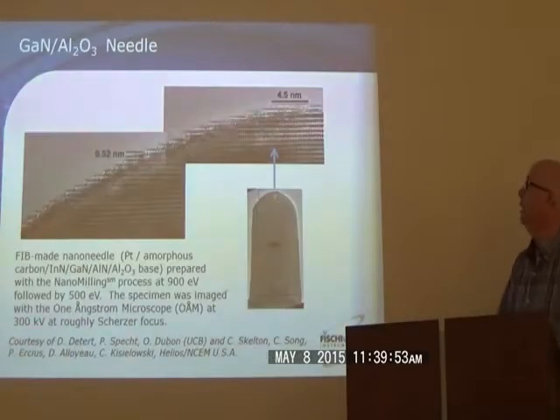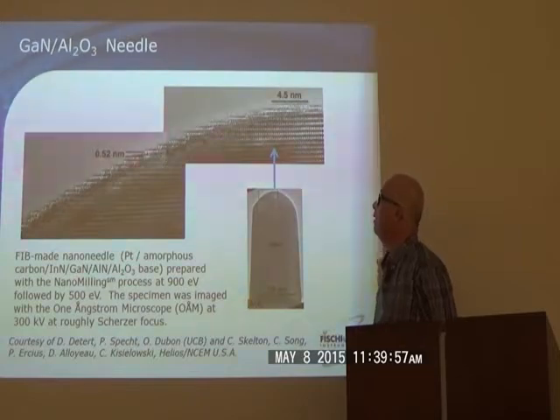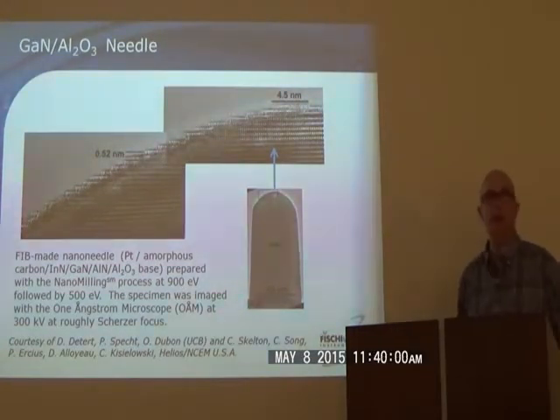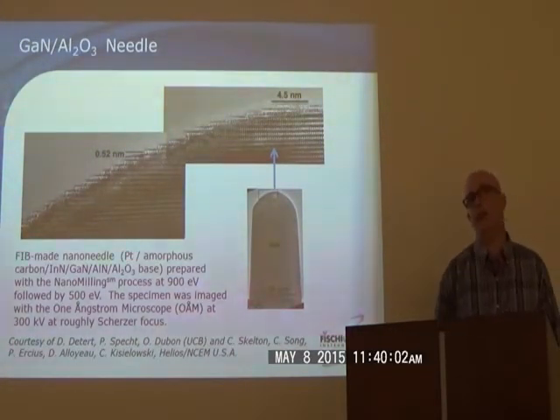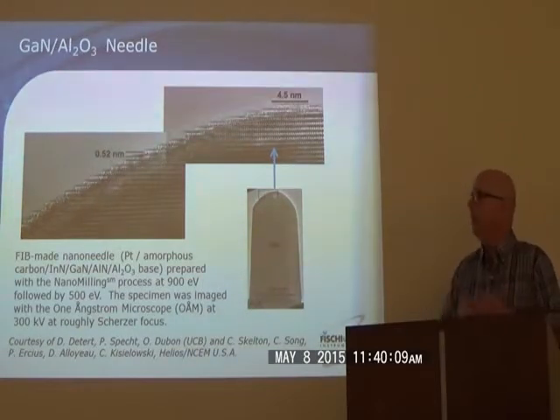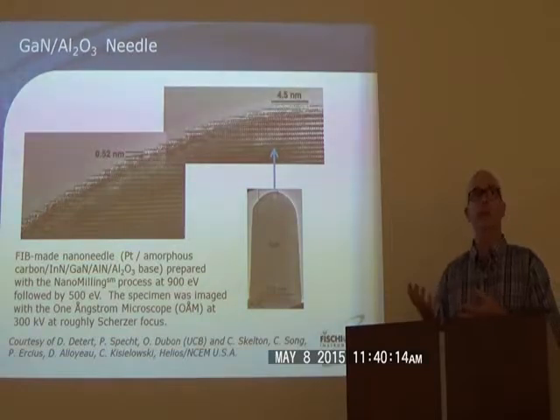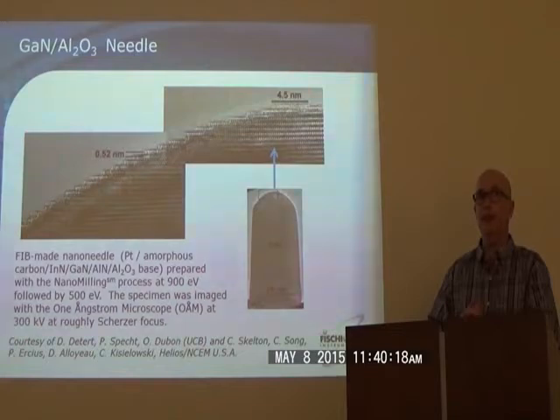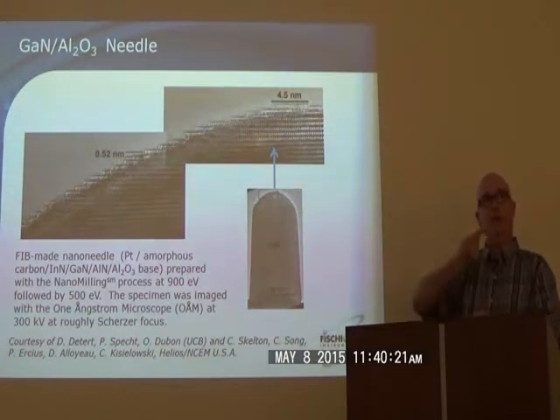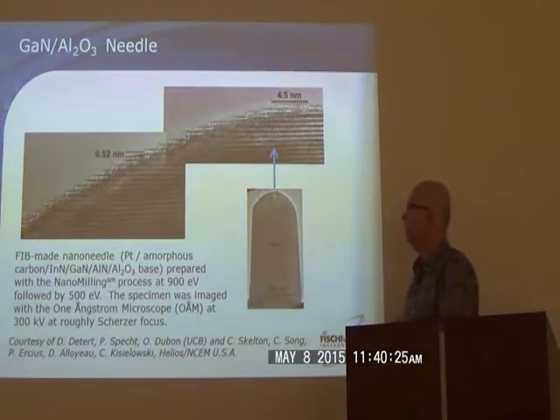Next slide. And this is another totally different type of FIB sample. They're becoming very popular. They're needle type samples. If you can imagine, the sample itself is probably a few microns tall by maybe 100 nanometers in diameter. And there's a lot of advantages for those type of materials in those type of geometries. You can do mechanical testing on them. You can use our 2050 tomography holder, spin the sample into TEM and do tomography and some other things. And we can nanomill those samples also.